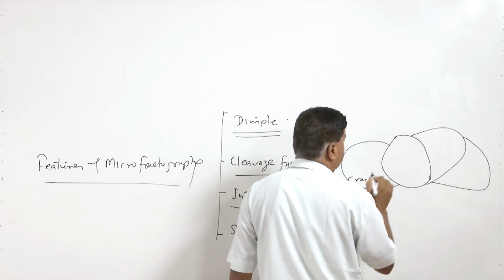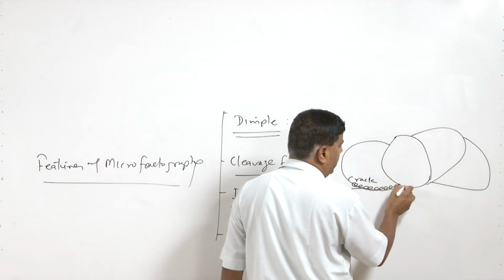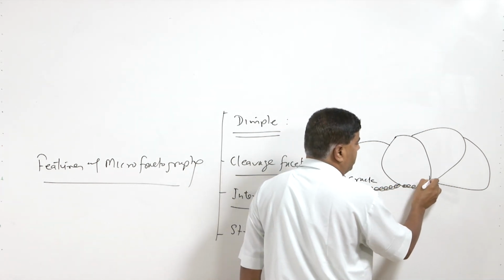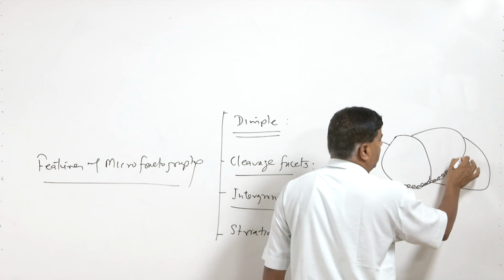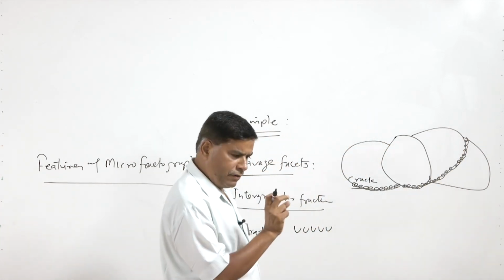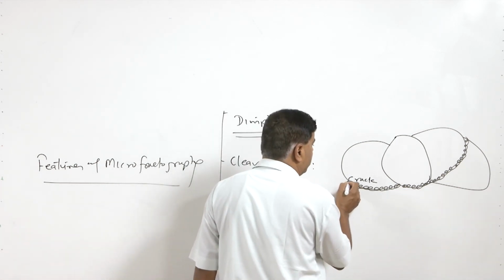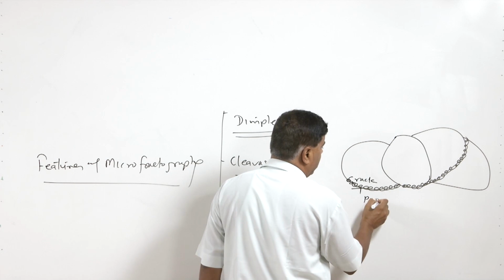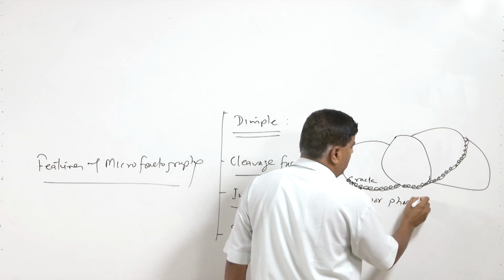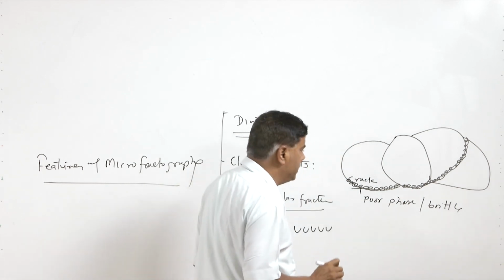Sometimes the presence of poor phases at the grain boundary or undesirable precipitates in the form of plates or thin layers, which are brittle, have limited load carrying capability.